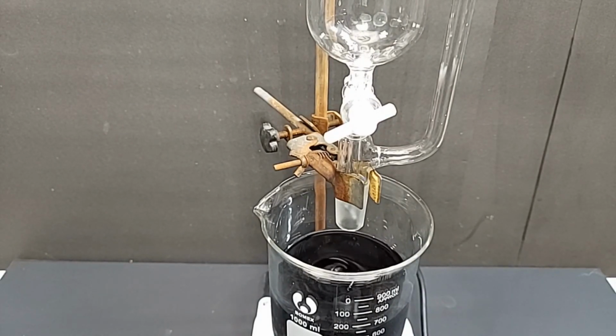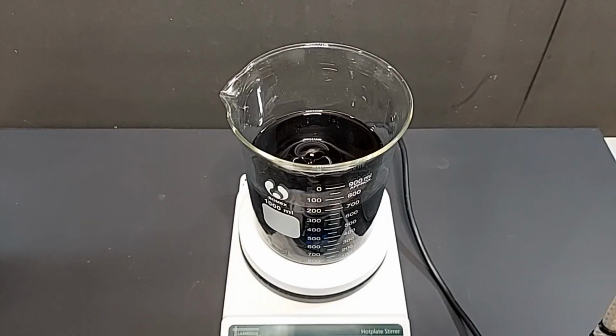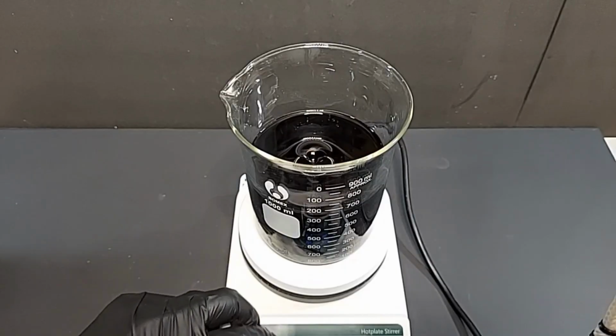So I'm going to take everything apart and we'll start heating it. Now that everything is nice and simple, I'm going to start heating it, and I'm going to start around 50 degrees Celsius. Again, this has to go slow, and I'll kind of monkey with the temperature depending on what I see happen.